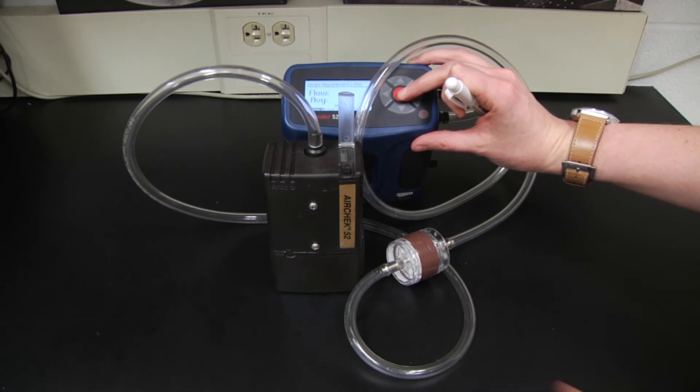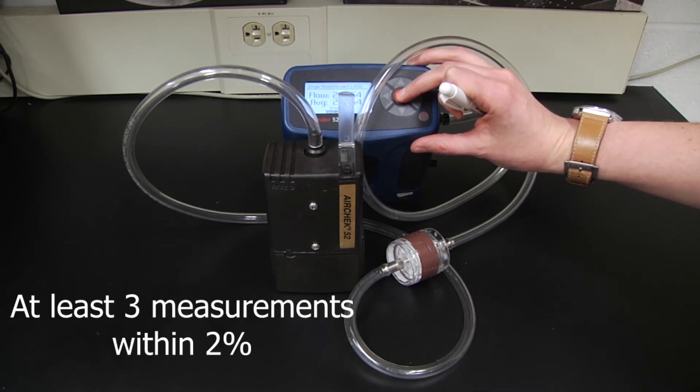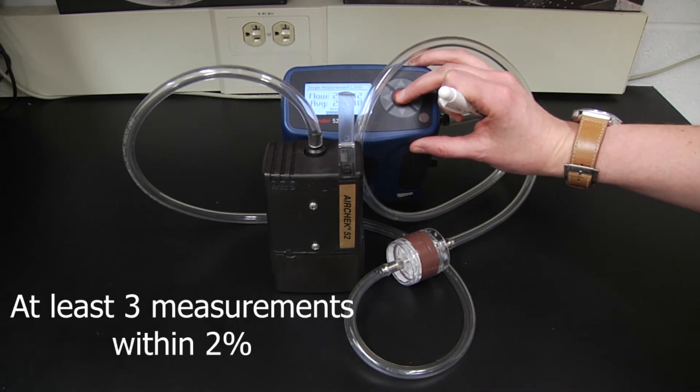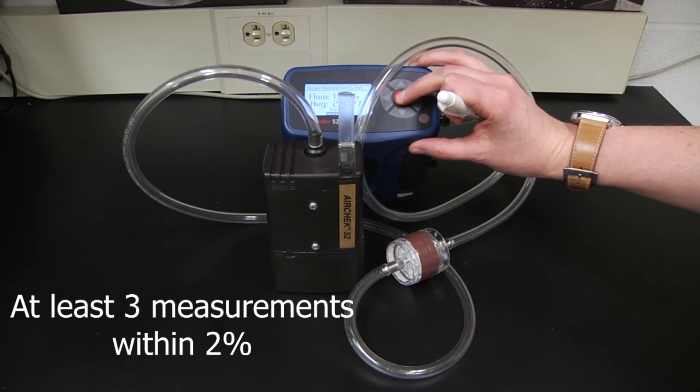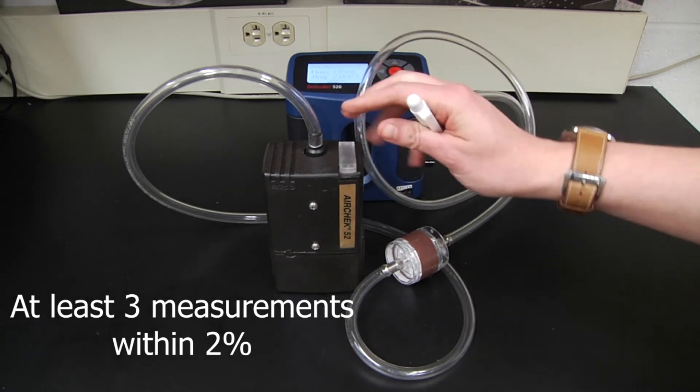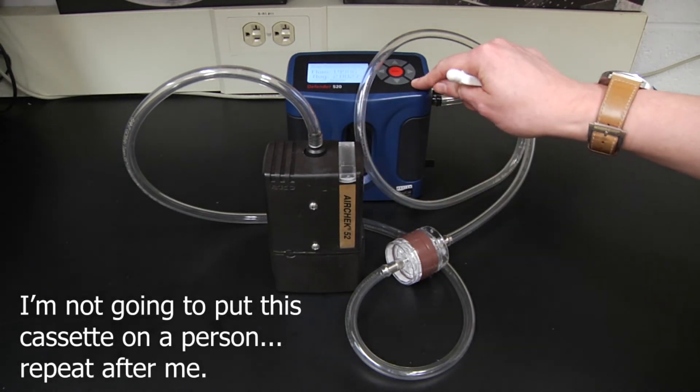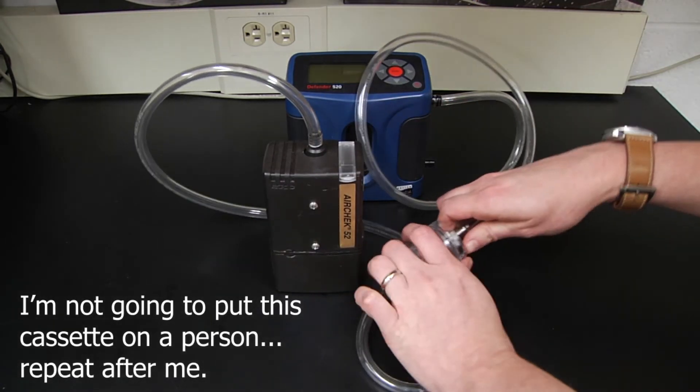Once you've adjusted the pump to your desired flow rate, perform at least three consecutive measurements that should be within 2% of each other. Average these measurements and turn off your pump. Before sampling, be sure to attach fresh media to your pump.